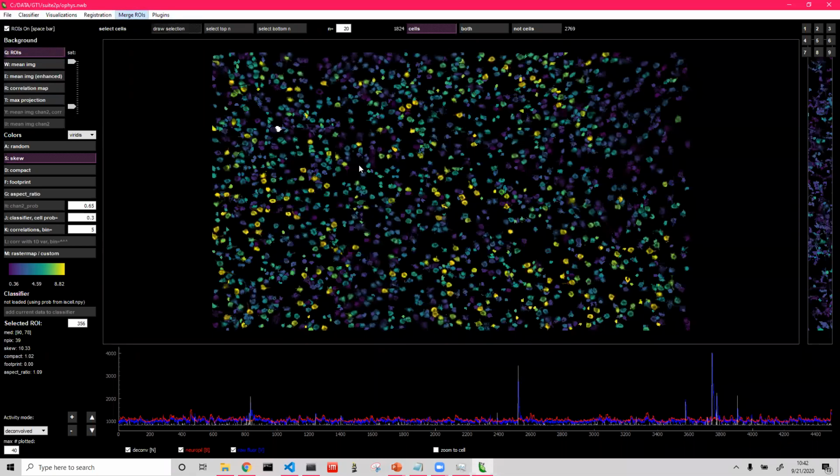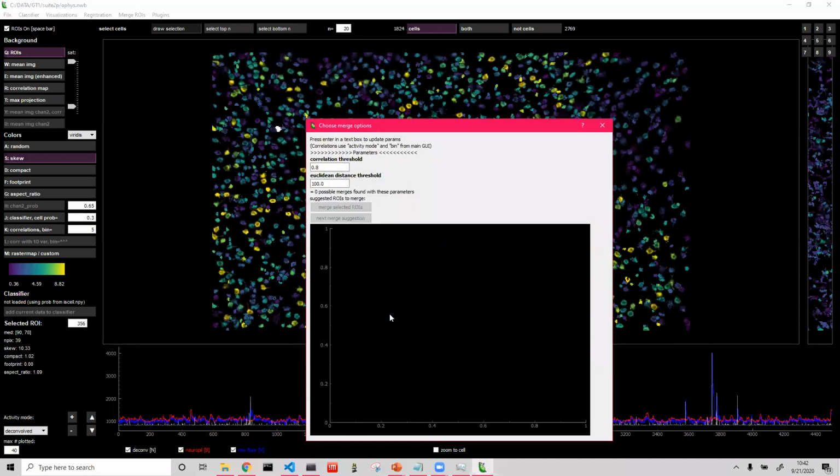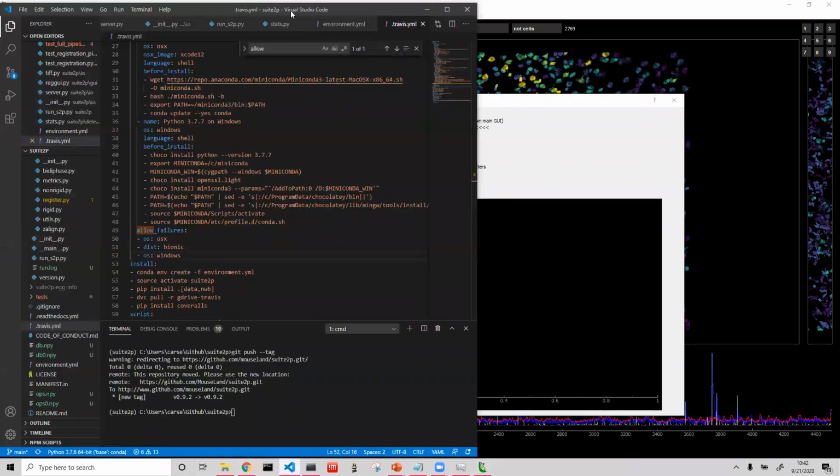There's a new window now too. You can auto suggest merges. Do you use any specific ontology for NWB? What do you mean by that? I used what I learned in the first workshop. Oh, the names of the fields. Yeah, I sort of made my own names for some of the fields, which were required.